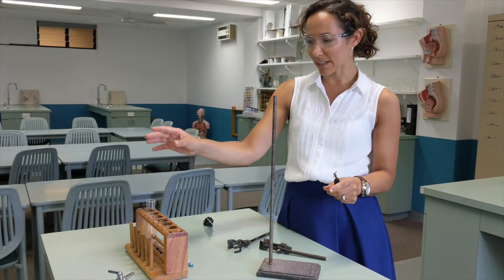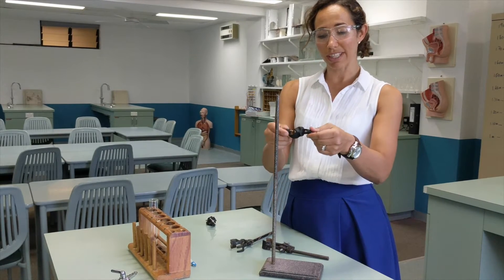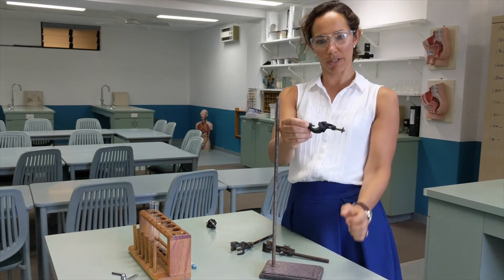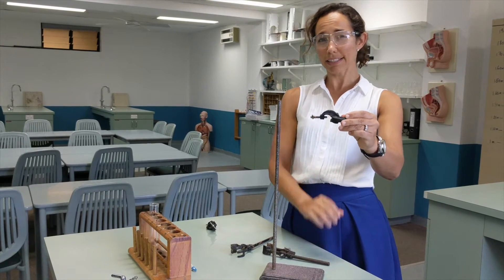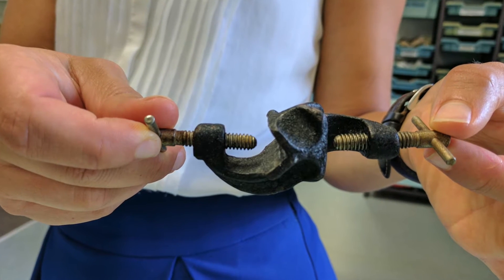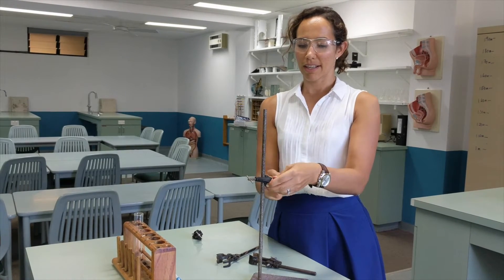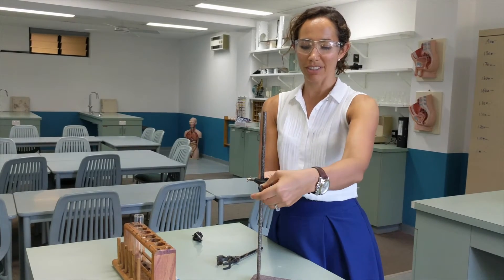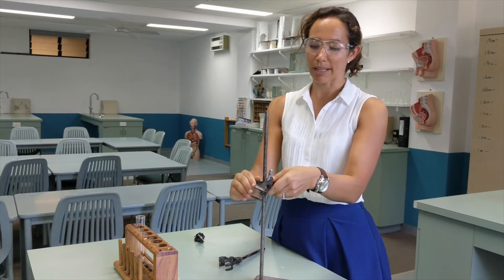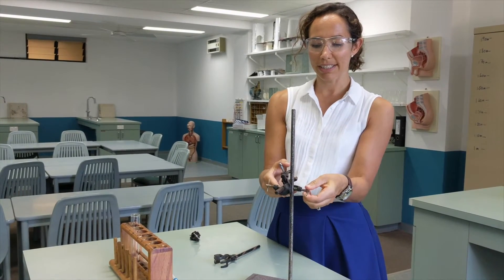The first step is to attach your boss head to the retort stand. Something that a lot of people get confused with is which way around it should go — whether it goes this way or this way. It seems like a really insignificant thing, but I was always taught to put it so that the curve is at the bottom. That way, if your clamp happens to move, it's only going to hit the bottom and not fall all the way out. Whereas if it was upside down, there's a risk of it falling out.